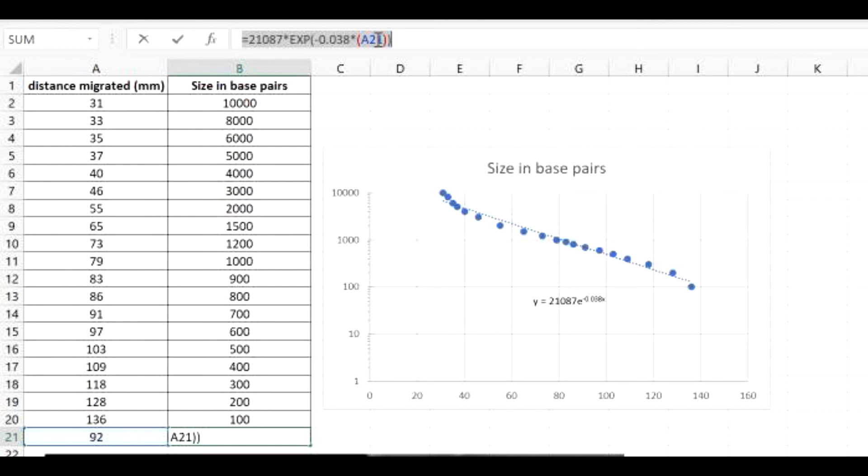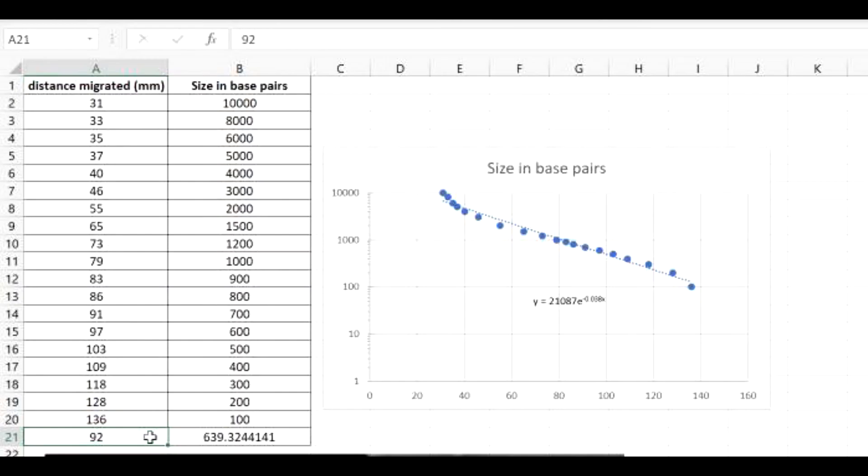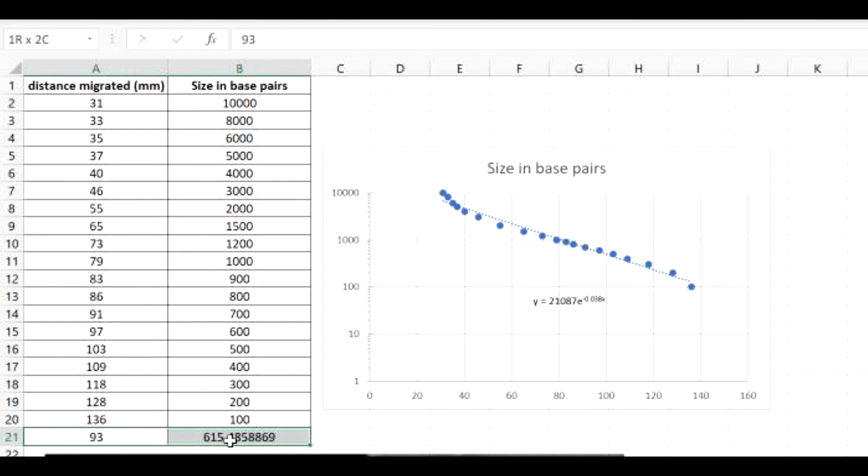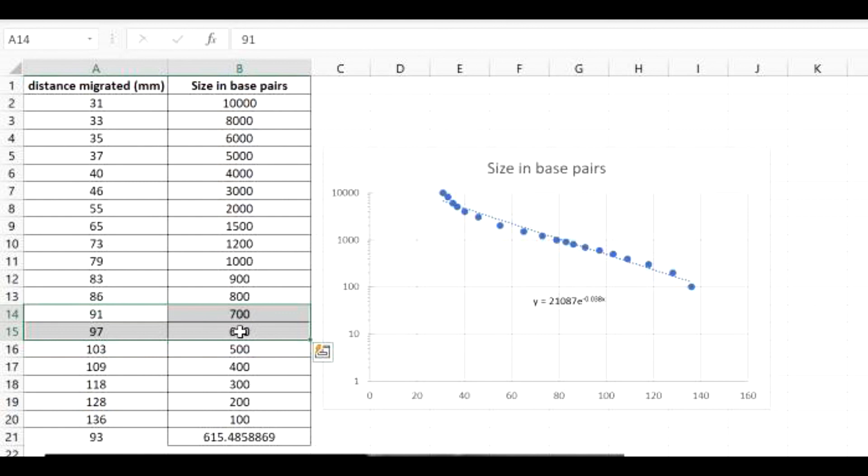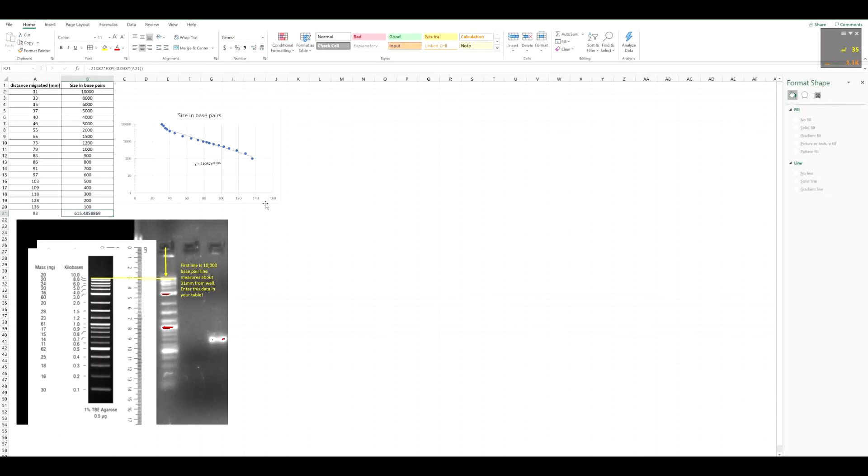And A21 is just referring to this cell here that I use for the unknown. This particular band here, I measured to be 92 millimeters from this well. So I just typed in 92 here, and it automatically solves it for you. If your band only migrated 55, the EXP formula will fill it out for you. It saves you the headache of having to calculate it yourself. You don't need to use this feature, but it's just something that will save you some time. You can actually double check your calculations, and if it makes logical sense, in that if it did migrate 93 and it is 615, 93 falls in between these two values. So your base pair size should fall in between these values. So if you look here, 615, 93 is 615, and it falls in between these. That's how you know you did your standard curve correctly.